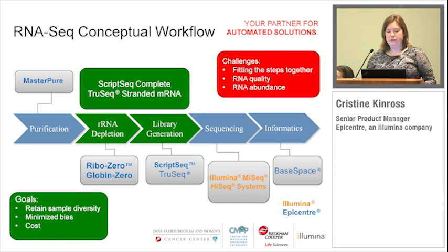So today we're focusing specifically on RNA sequencing, and the conceptual workflow is essentially the same regardless of the type of sample you're doing, FFPE, of course, being today's focus. And this begins with purification. The extraction of the DNA, for example, or the RNA in this case, is no small matter, as Michaela alluded to a few minutes ago, with the need to automate the entire process. But for the next few minutes, we're going to focus on the next two steps.